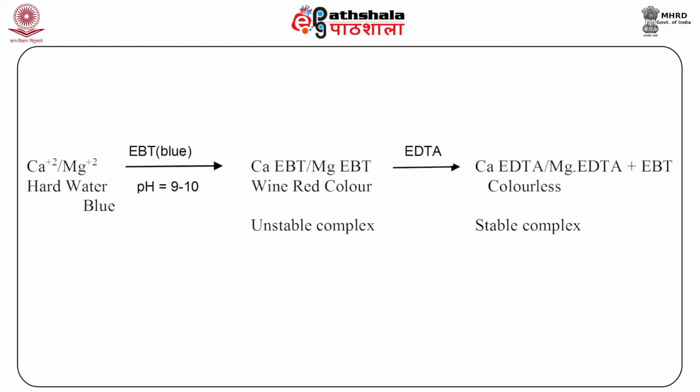The hardness of water does not show pollution parameter, but it gives the water quality. Water hardness is expressed in terms of calcium carbonate and is also determined by complexometric titrations.